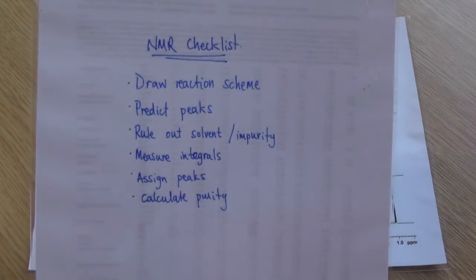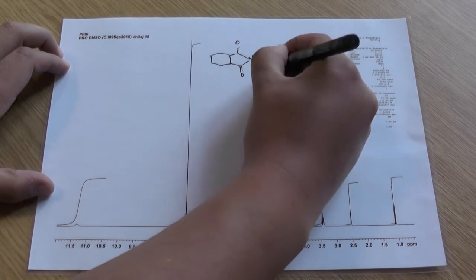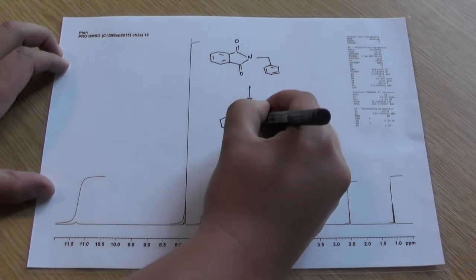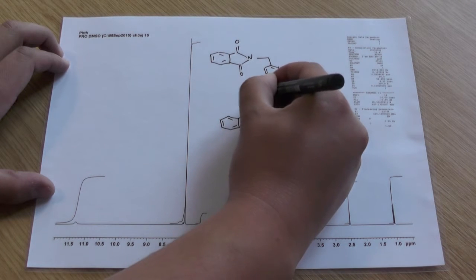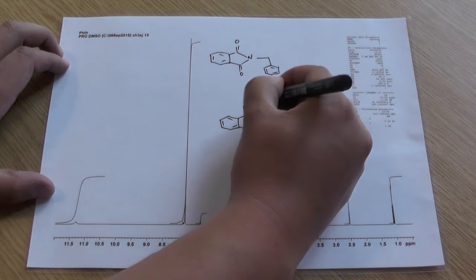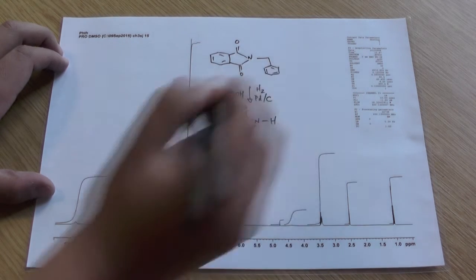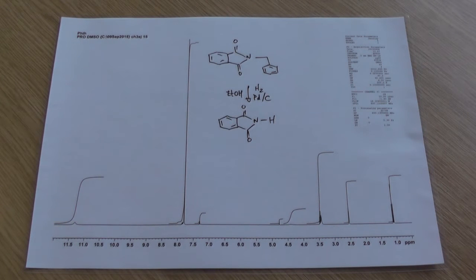First of all, you need to draw your reaction scheme. The reaction that we've chosen to look at is the de-benzylation of N-benzyl thalamide to thalamide. When you draw out your reaction scheme, you need to make sure you include everything that is used in the reaction, so all the solvents and reagents including the solvents used in the workup.